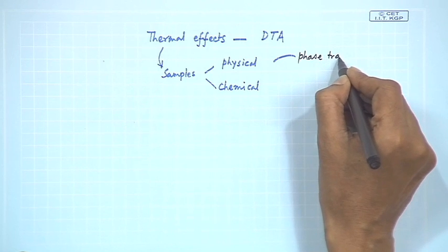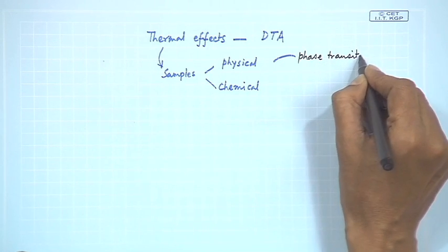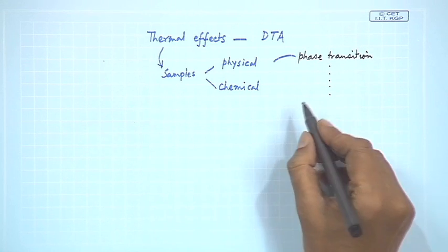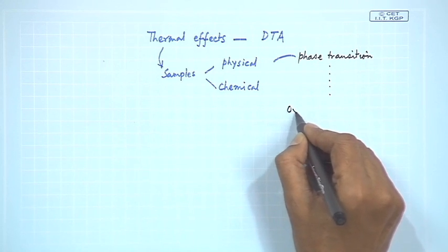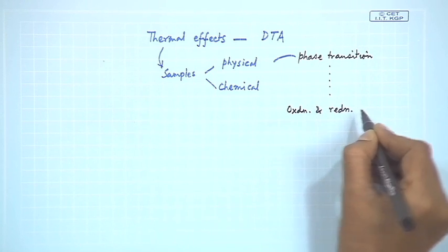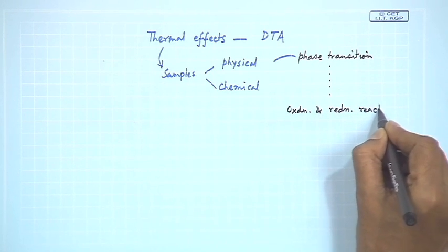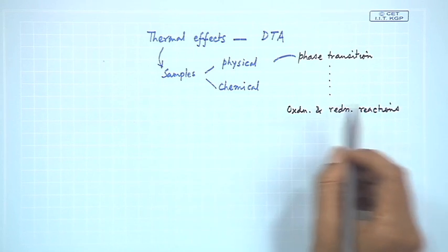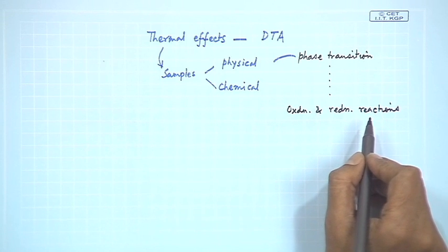So, starting from phase transition to many such processes where we can also monitor the oxidation and reduction reactions, including dehydration, vaporization and dissociation all.